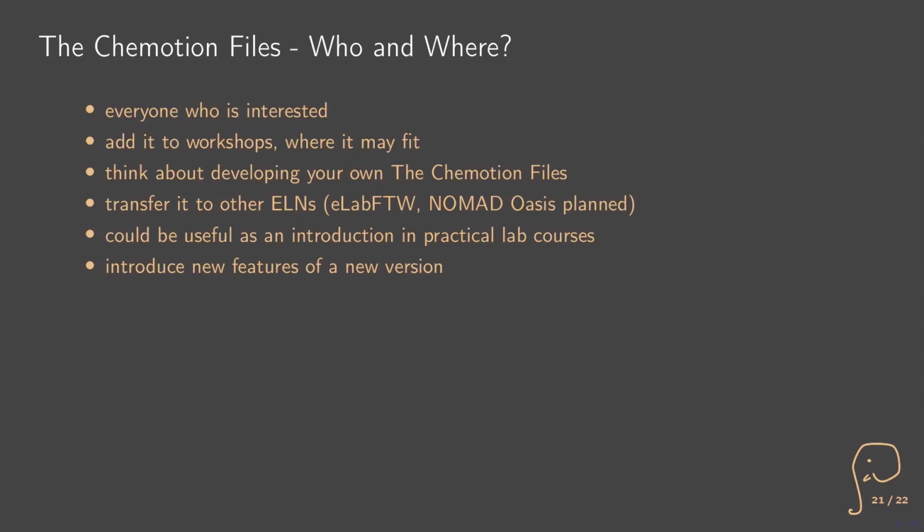This could, for example, be one example, but also the whole idea of developing your own Chemotion files if you're teaching Chemotion at your university, right? Add your examples into the whole data set and make it more customizable actually to your field.